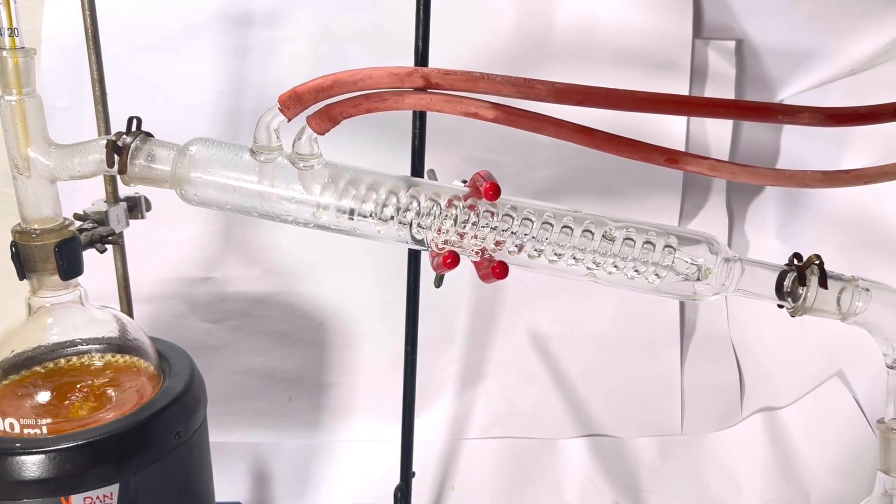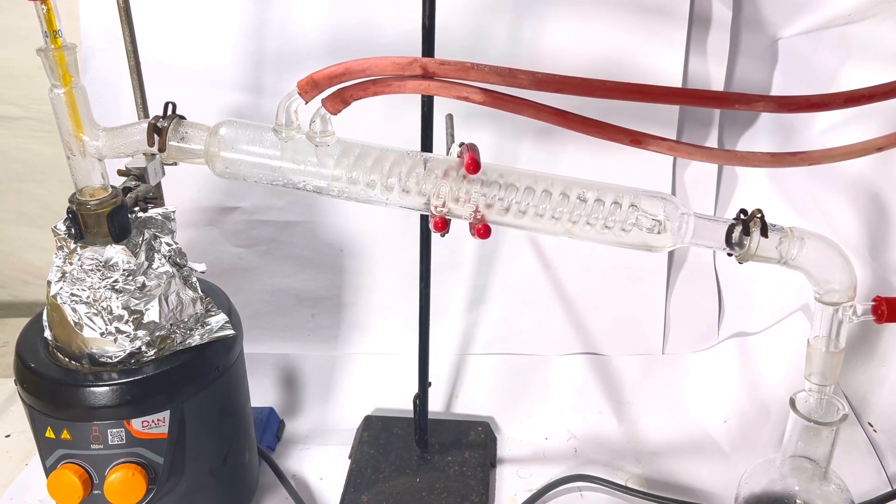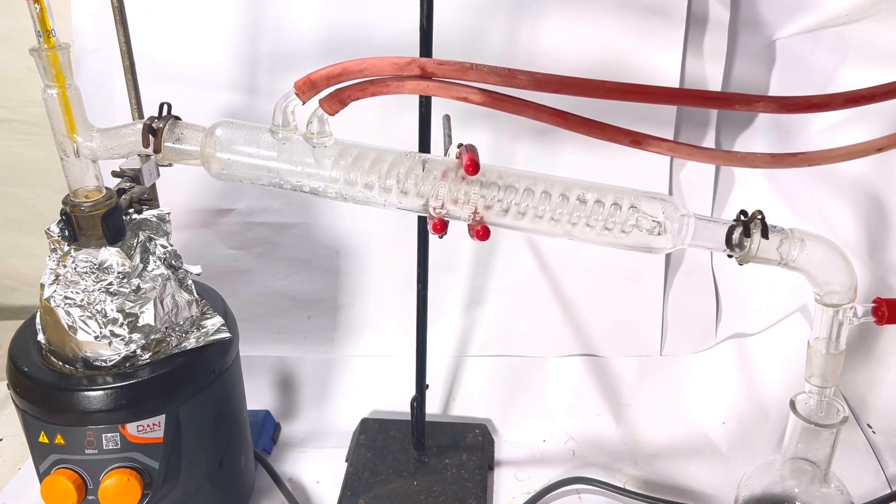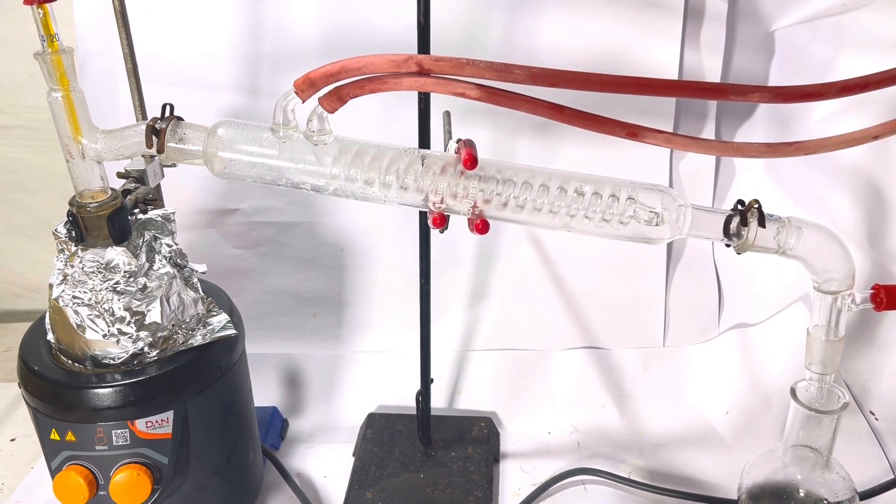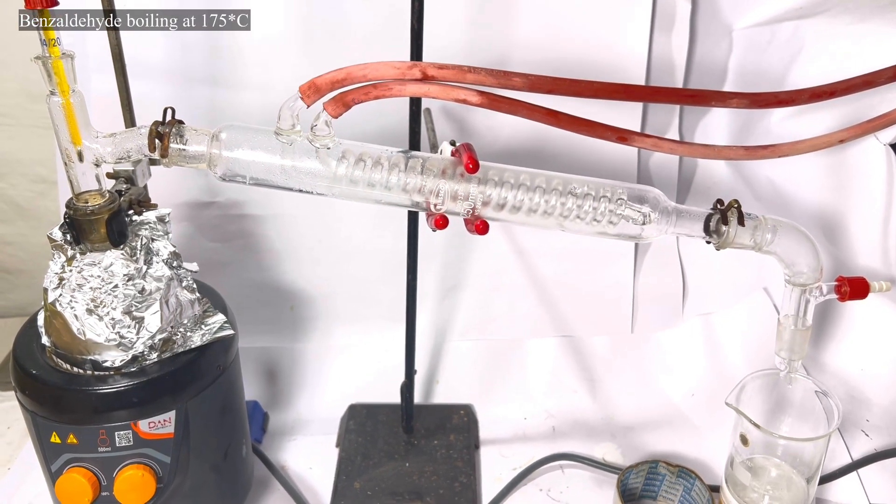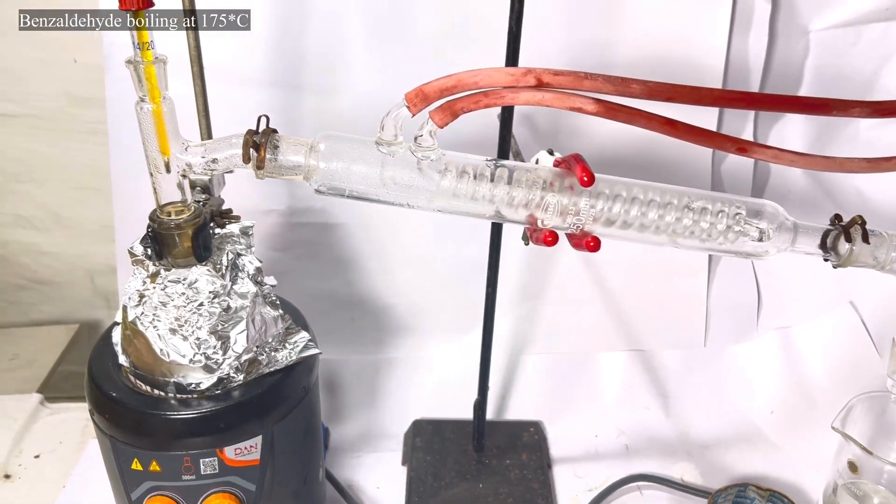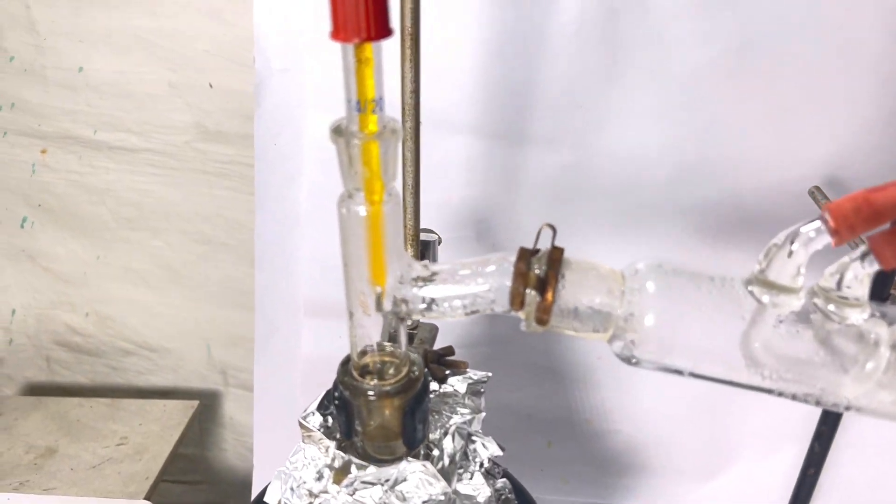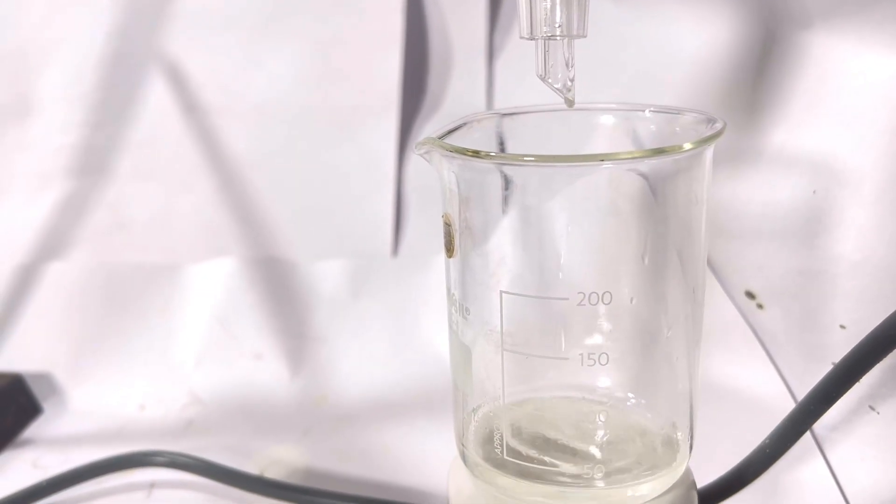After all water had distilled over, temperature starts to slowly climb and aluminum foil was used to insulate the apparatus. The thermometer now reads 178 to 180 degrees C and this causes the benzaldehyde to pass over from the flask. Here you can see the benzaldehyde being collected in a beaker.